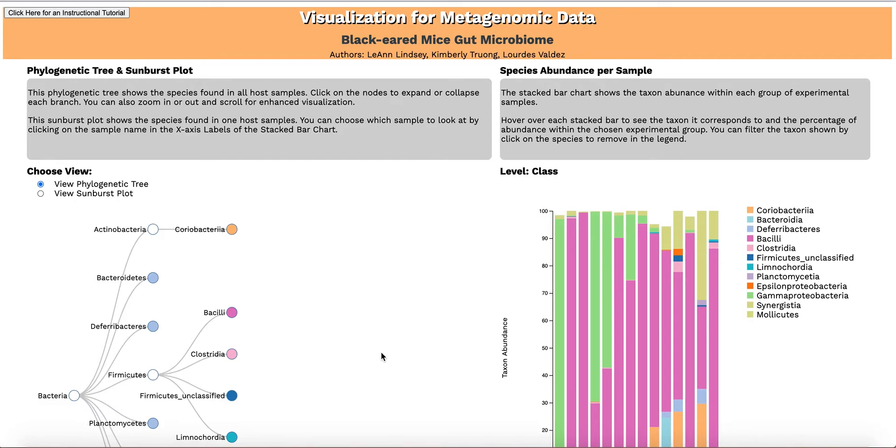Our tool allows a user to explore different aspects of this dataset, such as the evolutionary relationship between the species found in all samples, species abundance per sample, and information on gene pathways and function.